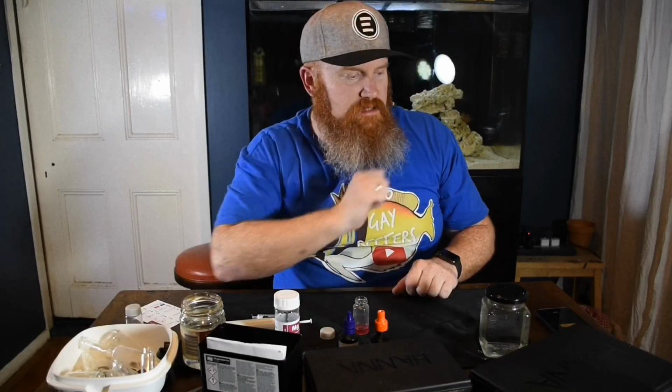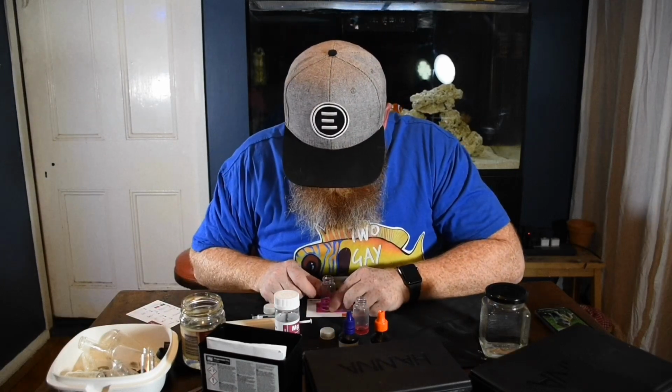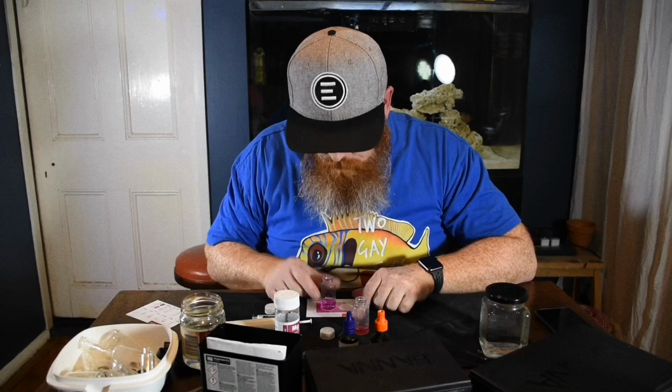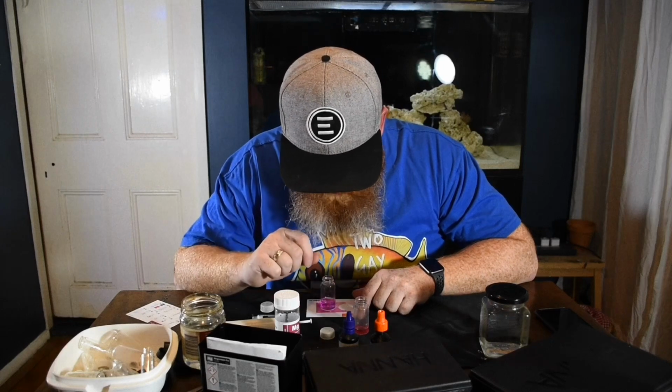All right, that is the timer for the nitrate test. So it looks like our nitrate has crept up again. So for a little while there, it was sitting around that sort of 5 to 10 mark. It's actually now crept back up to about 20.